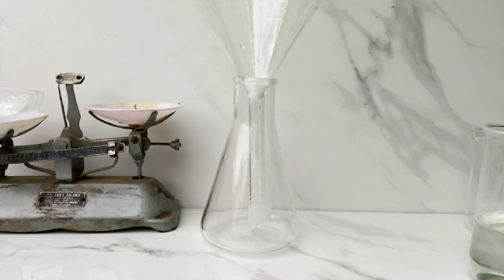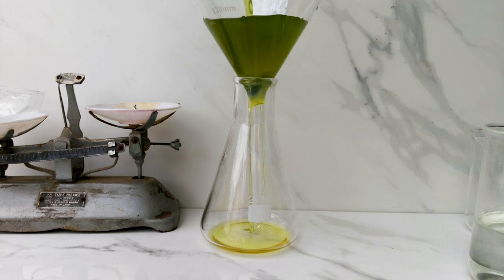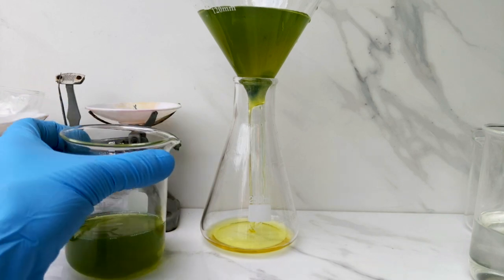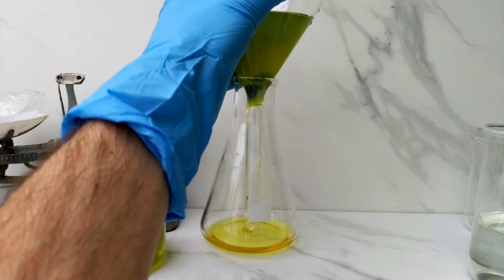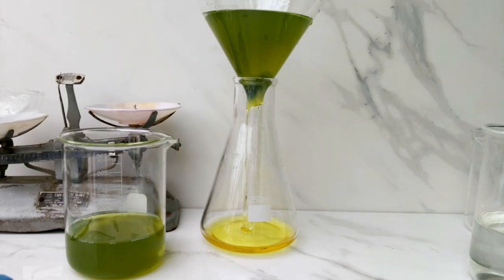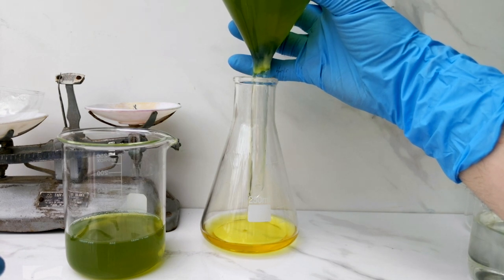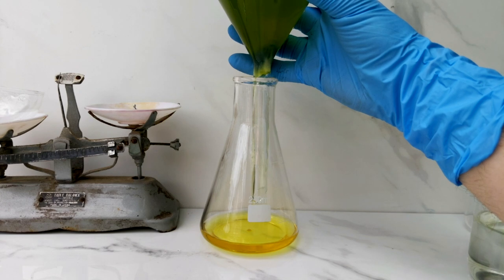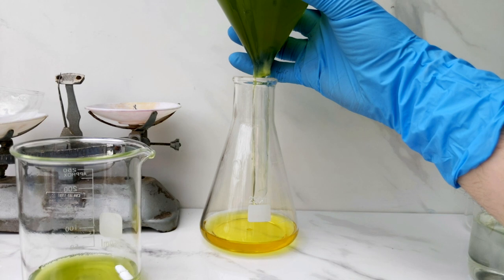To overcome the contamination problem in the sodium sulfide solution, I decided to give it a quick filter through some cotton wool. As you can see, there's a green discolouration in the liquid at the top, but as it filters through you can see it becomes quite clean and a pale yellow. Even though sodium sulfide solutions are supposed to be clear, I think due to the lower grade quality of the sodium sulfide it just ended up with a yellow discolouration, which shouldn't have any bearing or effect upon the final result.